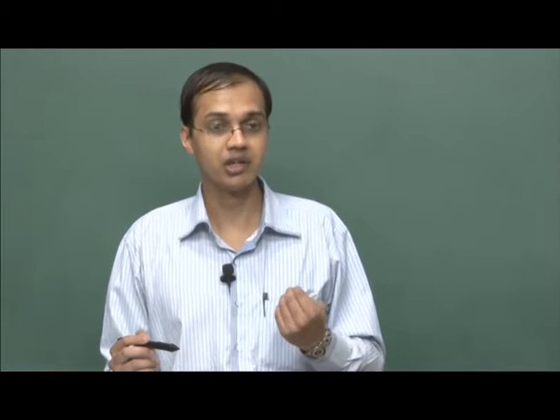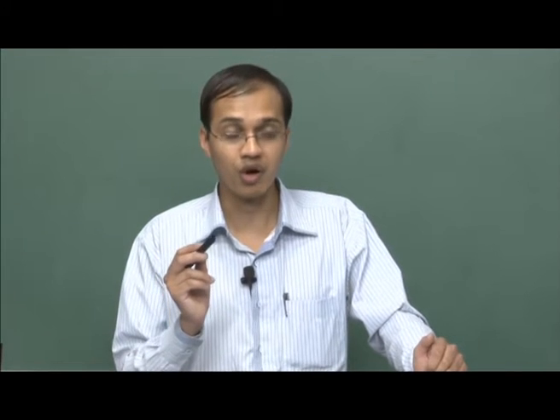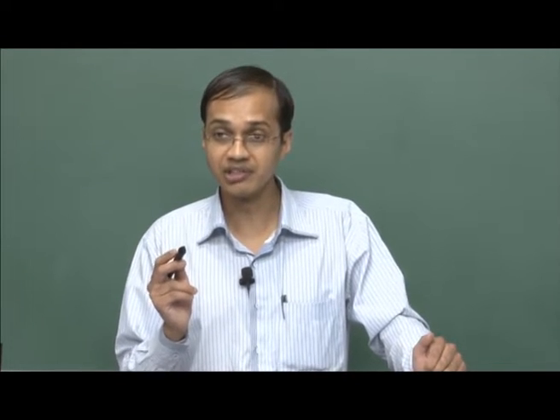Obviously, when we are studying a thin film or the nanoscopic deposited particles, we are more interested in these particles, and therefore we want the diffraction information from these particles. We want to get maximum information from these particles. Therefore I hope you appreciate that my theta has to be greater than the theta critical of the particles or of the thin film.